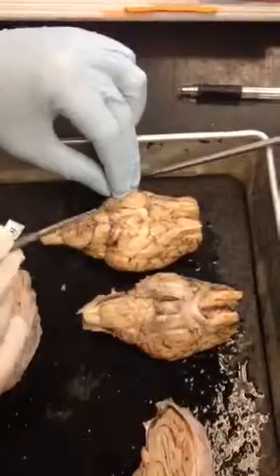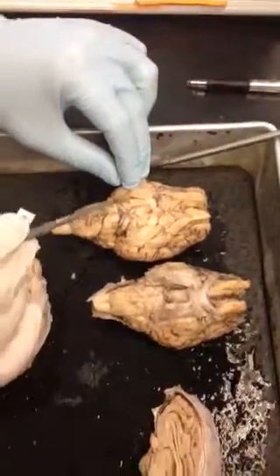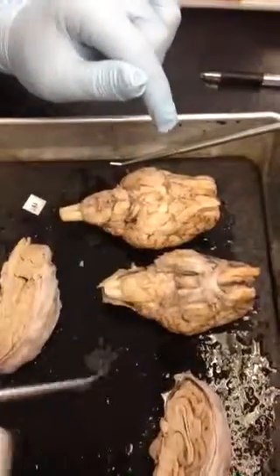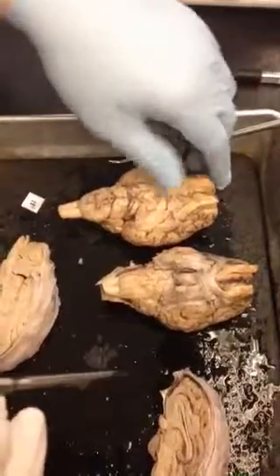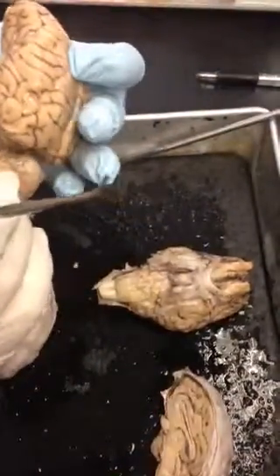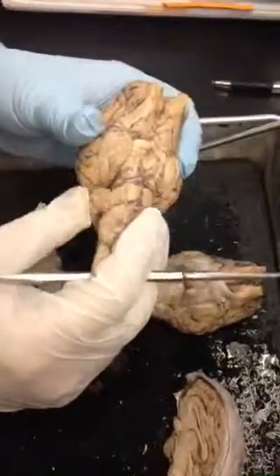On this brain, where it would come off of the brain would be right here, but it just got sliced off. But this is it right here. And then the number 4. It's really small, and a lot of times it gets ripped off.